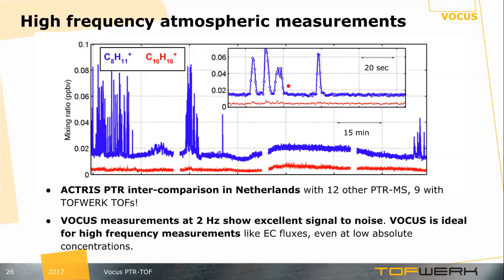So this kind of high frequency measurement is basically exactly what fluxes are made from. And so this type of instrument with high sensitivity would be ideal for fast processes like eddy covariance fluxes, even at low absolute concentrations.